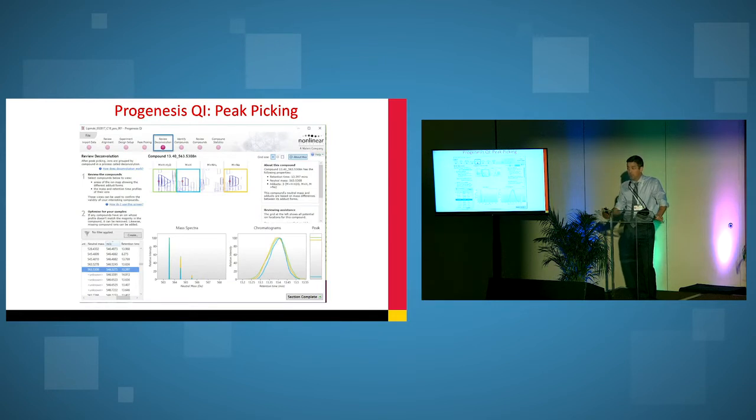The peak picking process of the software, here I've highlighted where this is just a ceramide peak that I've picked out. What's interesting here is that it allows you to look at multiple adducts. Ceramides typically ionize with the M plus H minus water, but you can also see that the sodium peak is very abundant as well. There's also a smaller abundant peak in terms of the M plus H. The adduct formation can be viewed as a pro or a con depending upon how you're looking at it. Multiple adducts gives you kind of increased confidence that you have your lipid species of choice, but it also splits the signal as well across multiple adducts, which can reduce your sensitivity. You also have some issues in terms of having multiple adduct formation. They provide different types of fragmentation.